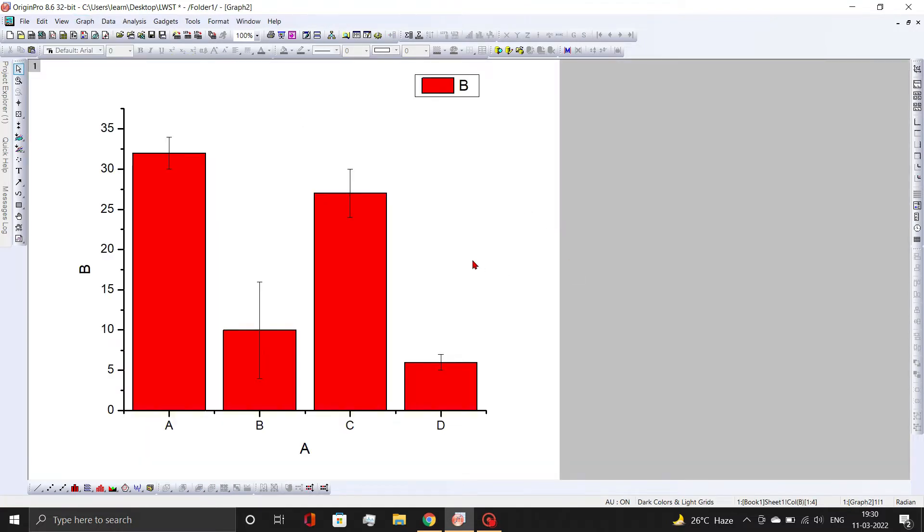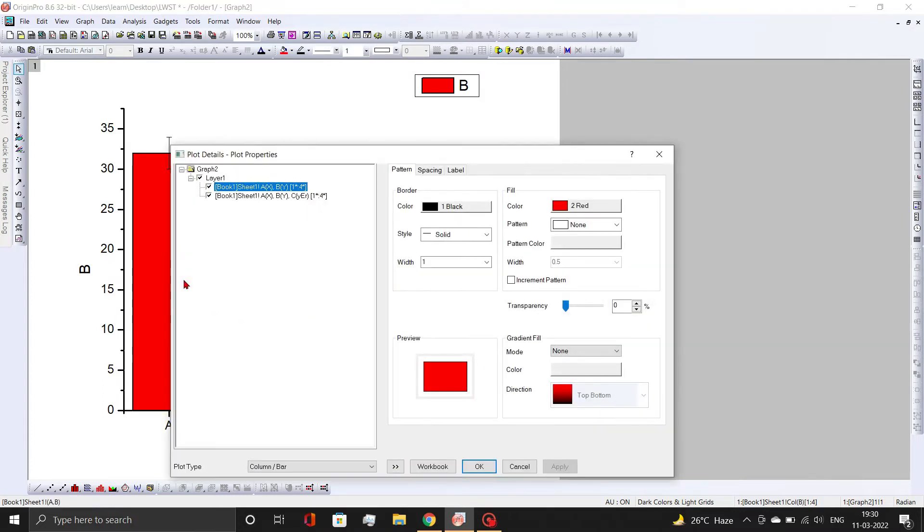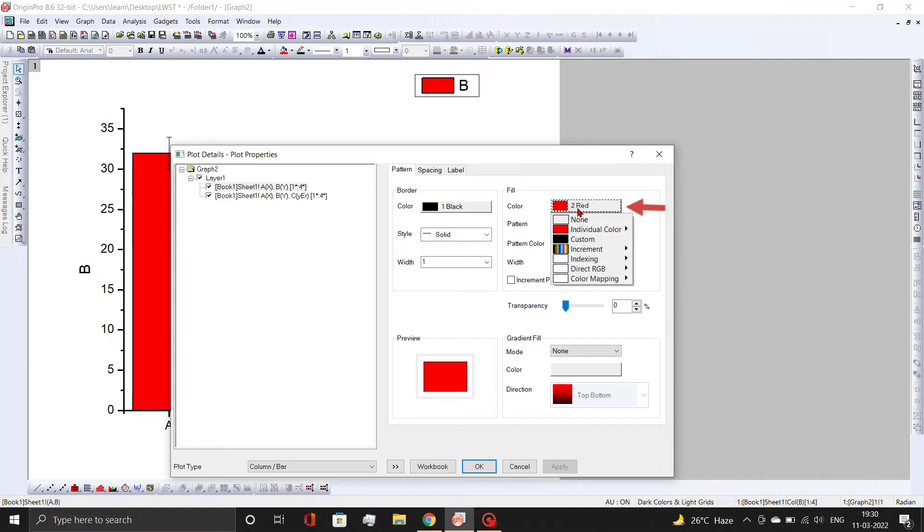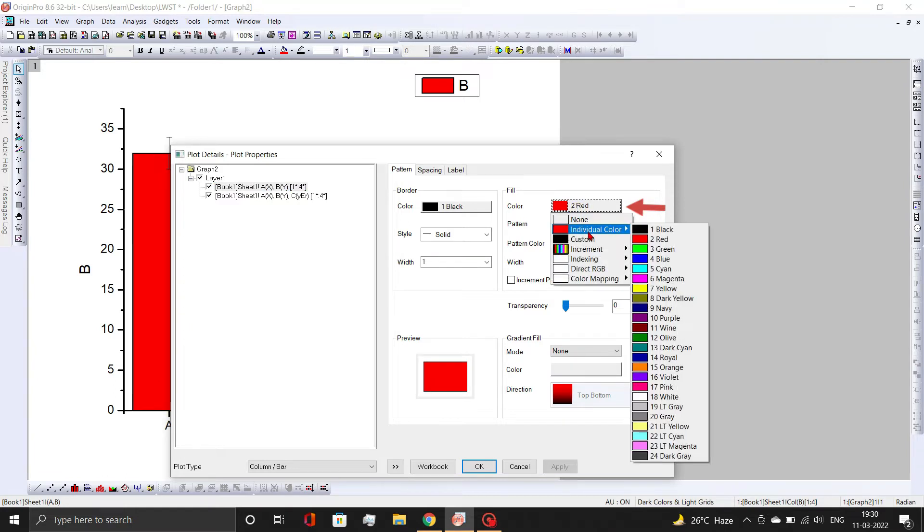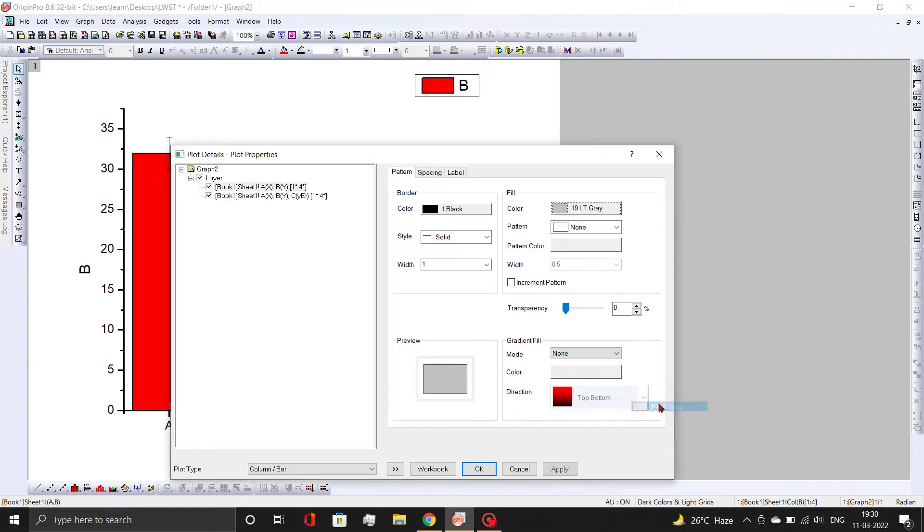A graph is now plotted with the default setting of the Origin software. However, this graph is unsuitable for scientific publications and needs to be formatted. To begin formatting, double-click on the bars. A dialog box will open. Here change the color to gray and border width to 1.5 points as demonstrated. Always try to use dull shade colors instead of bright colors when plotting any graphs.